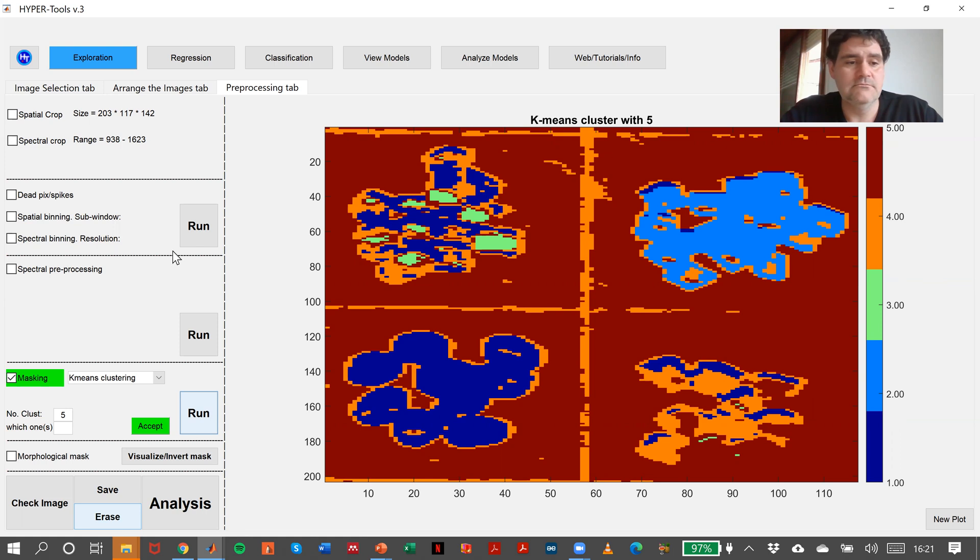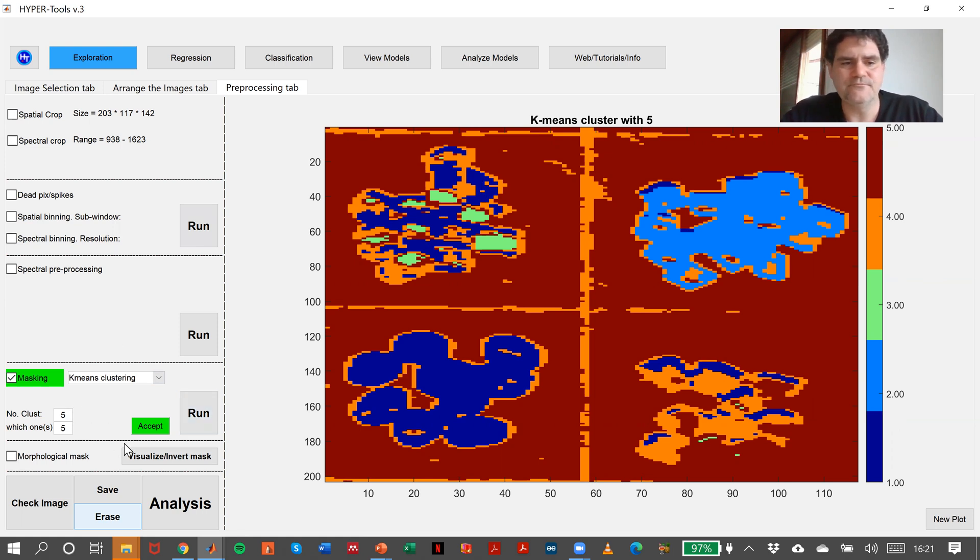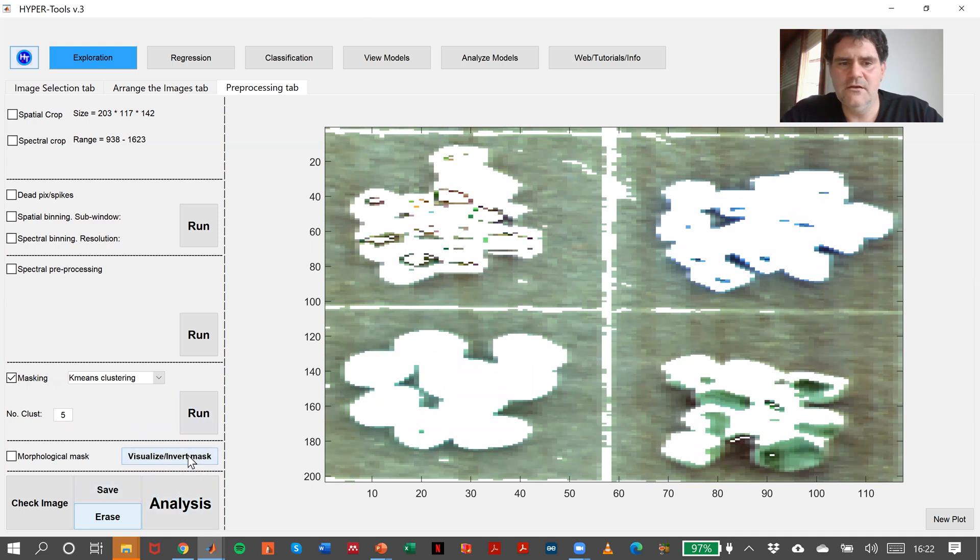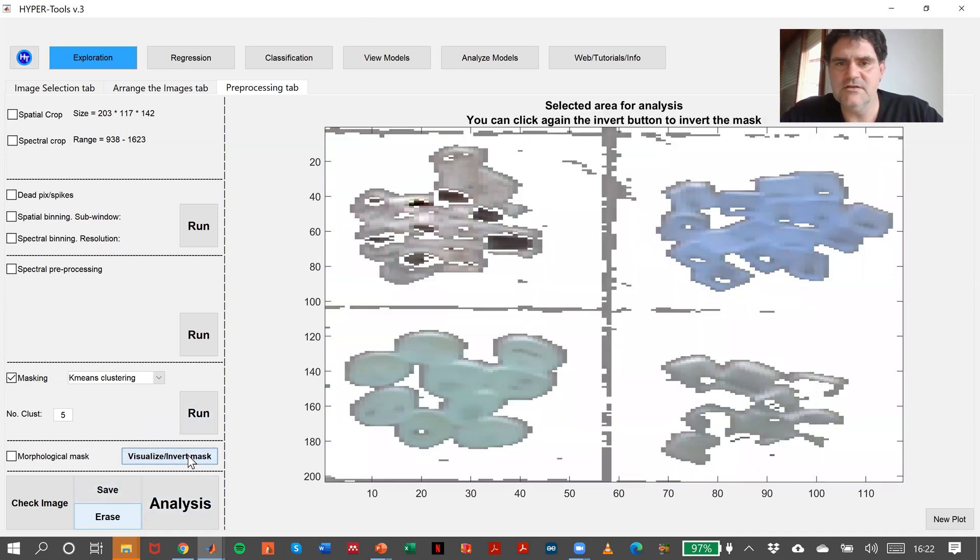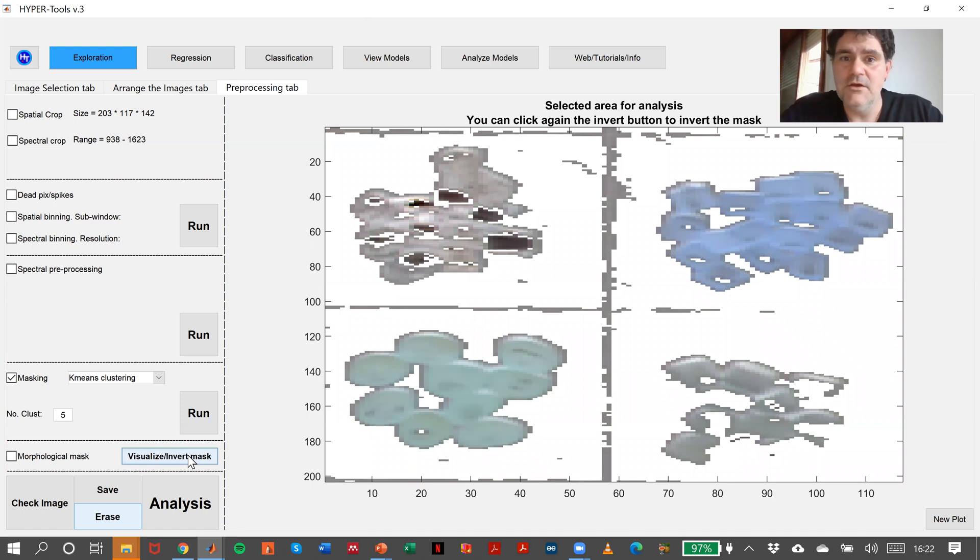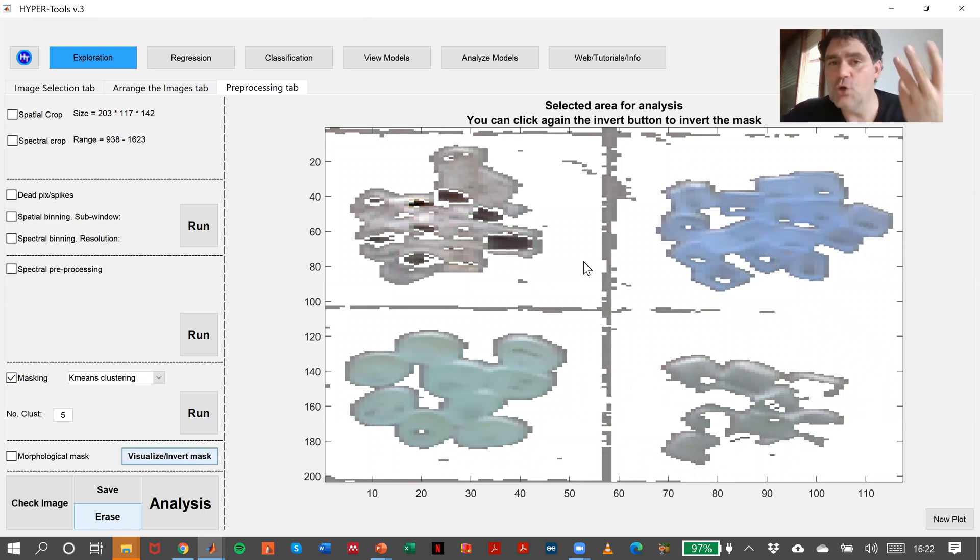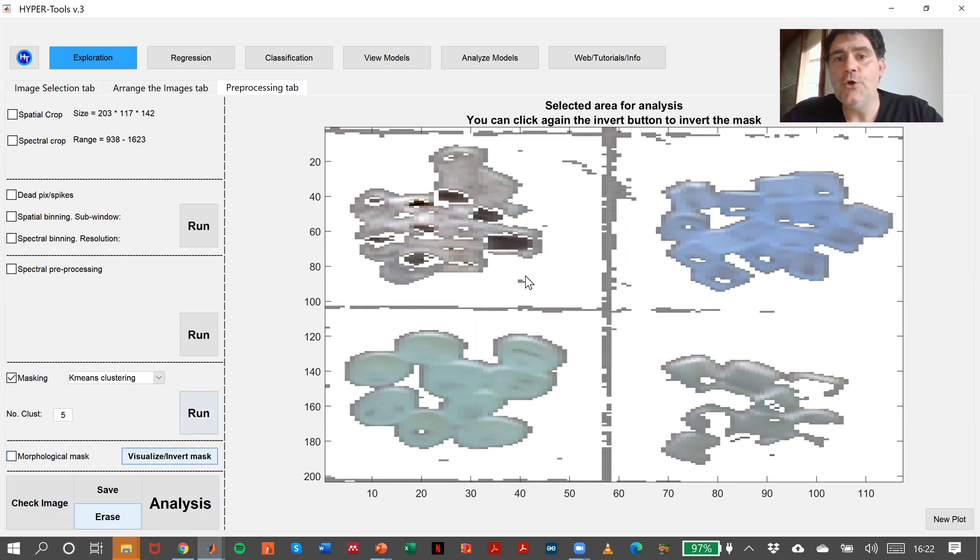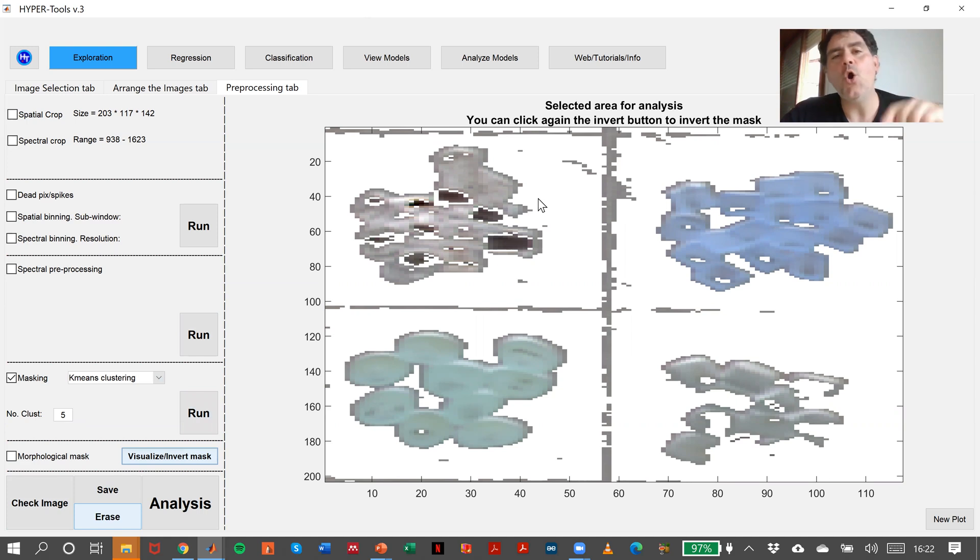The fourth cluster is something here, plus this one. And the fifth cluster is basically the background. We could think I can select cluster number five, accept, and look at that. This is what we have obtained.